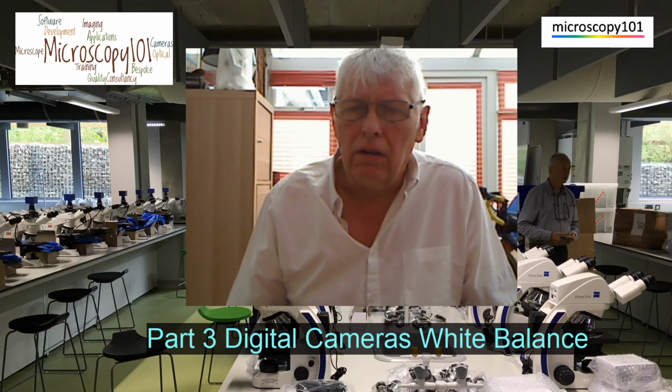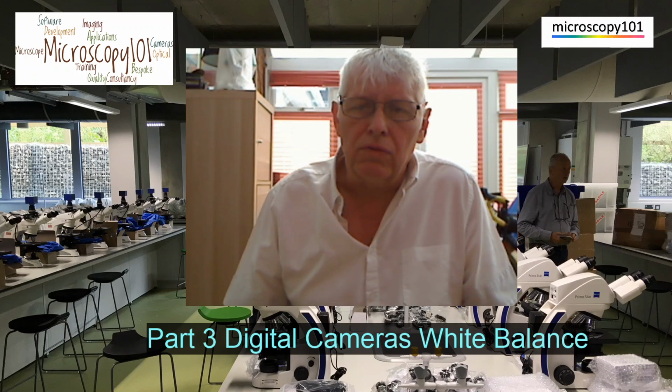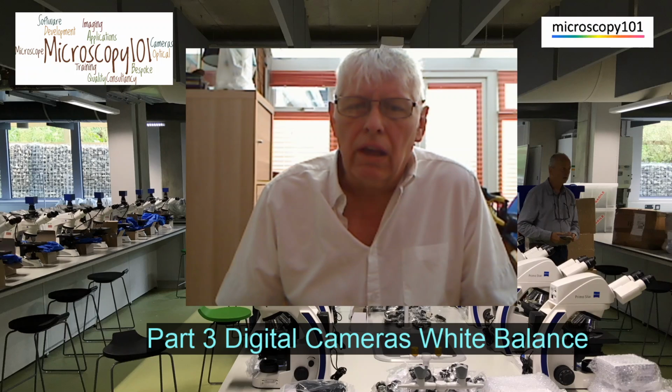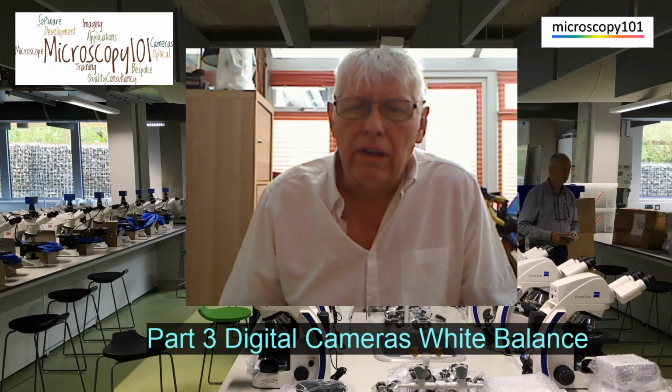Now, I'm making some assumptions. We've talked in another talk about exposure, and we won't be covering that today. And I'm assuming that you've got some microscopy knowledge and that you've used microscopes before. So the issue with the white balance is that the color camera has got effectively three chips or three sensors.